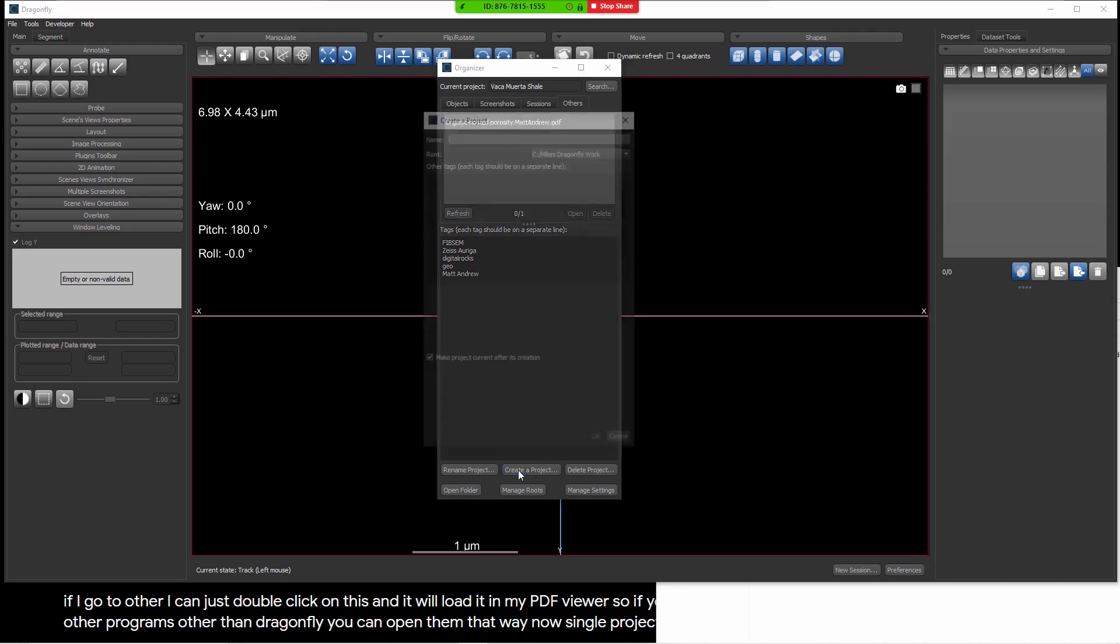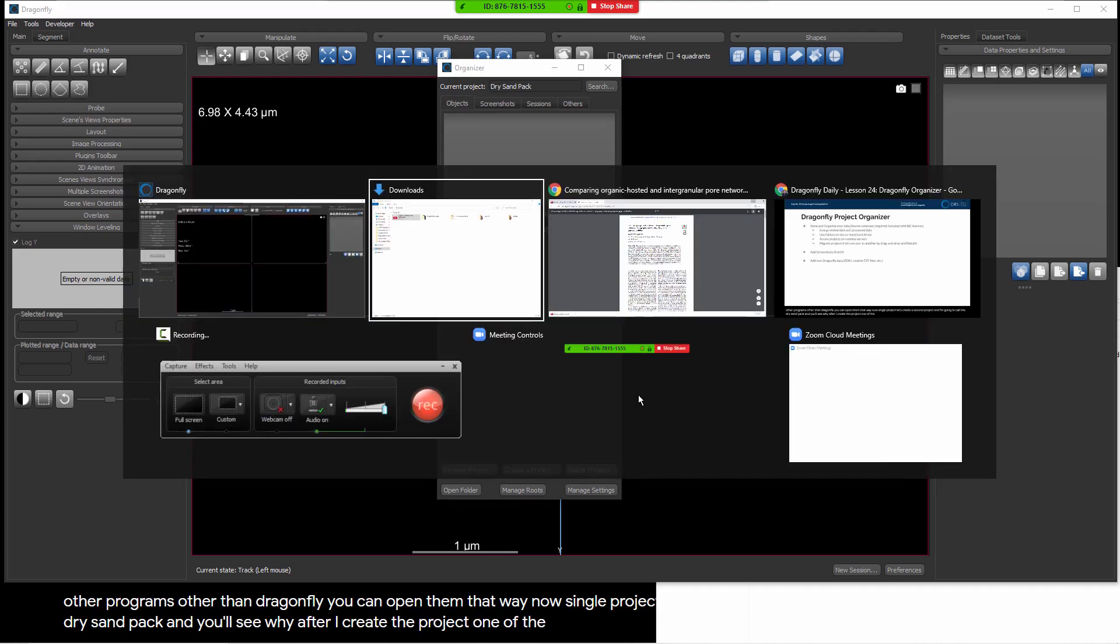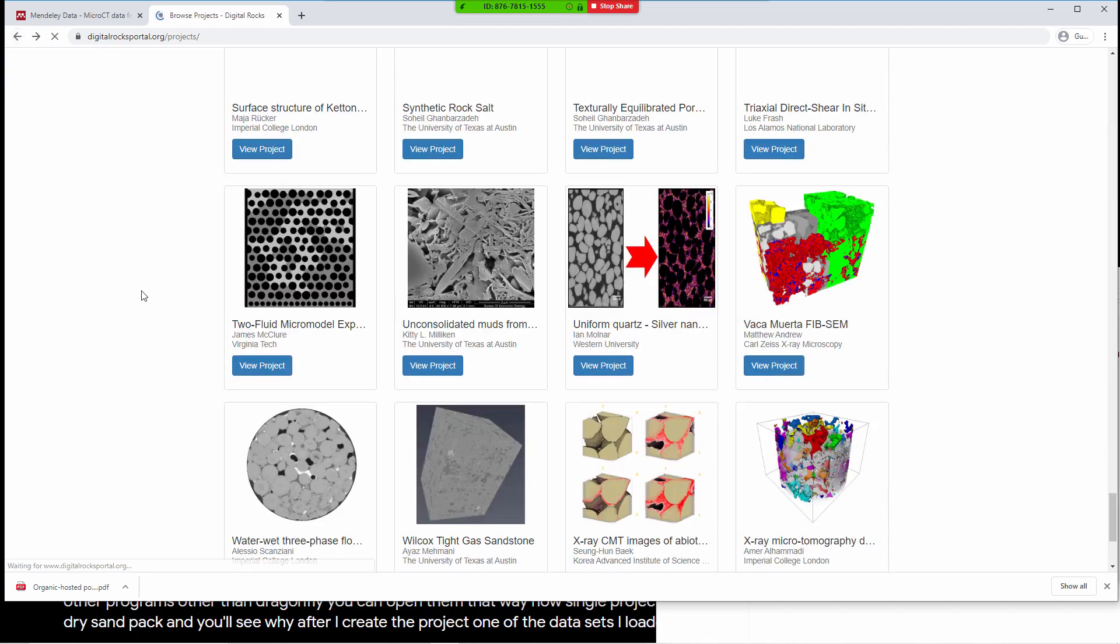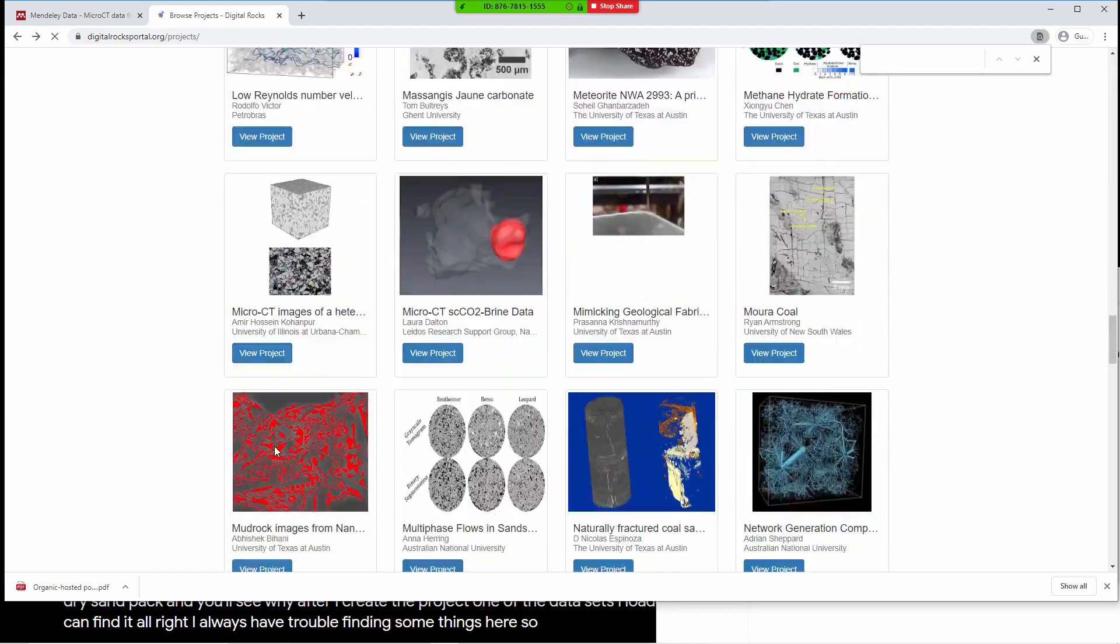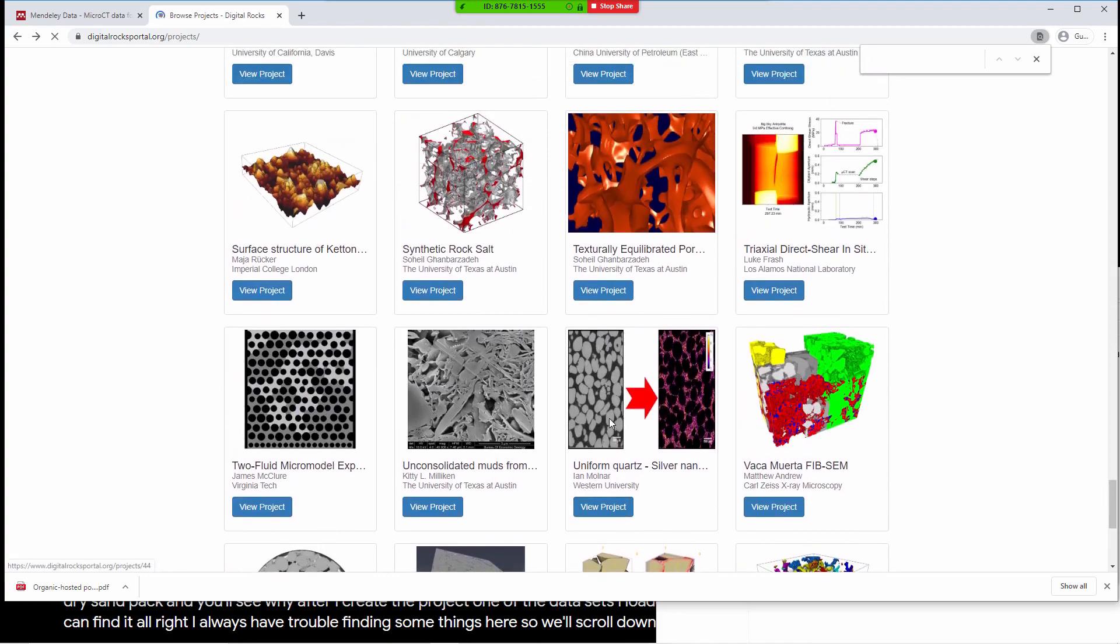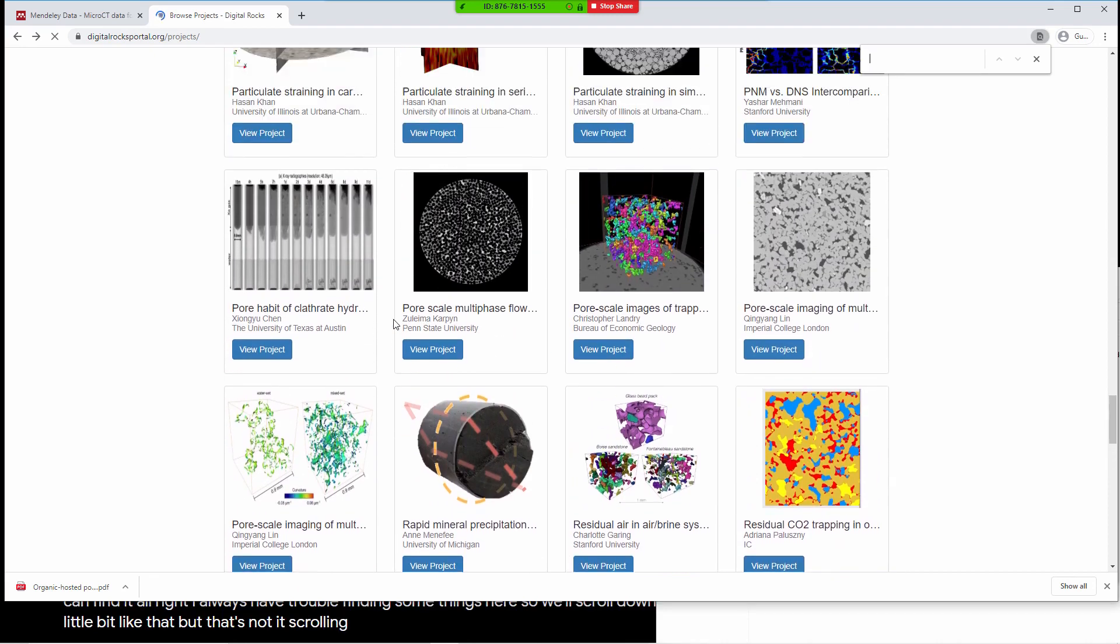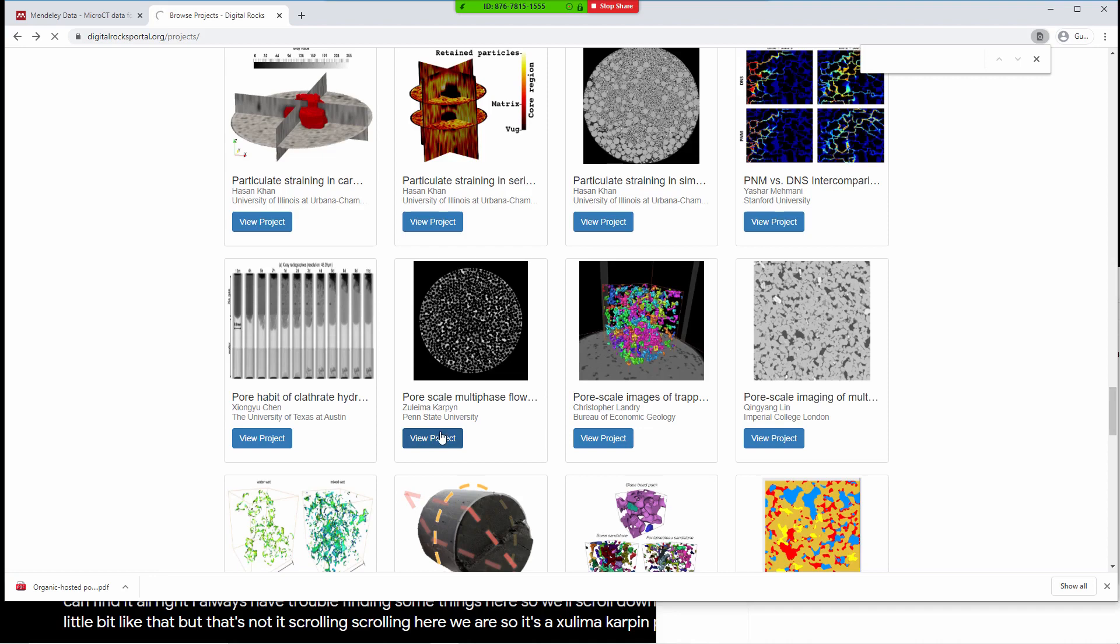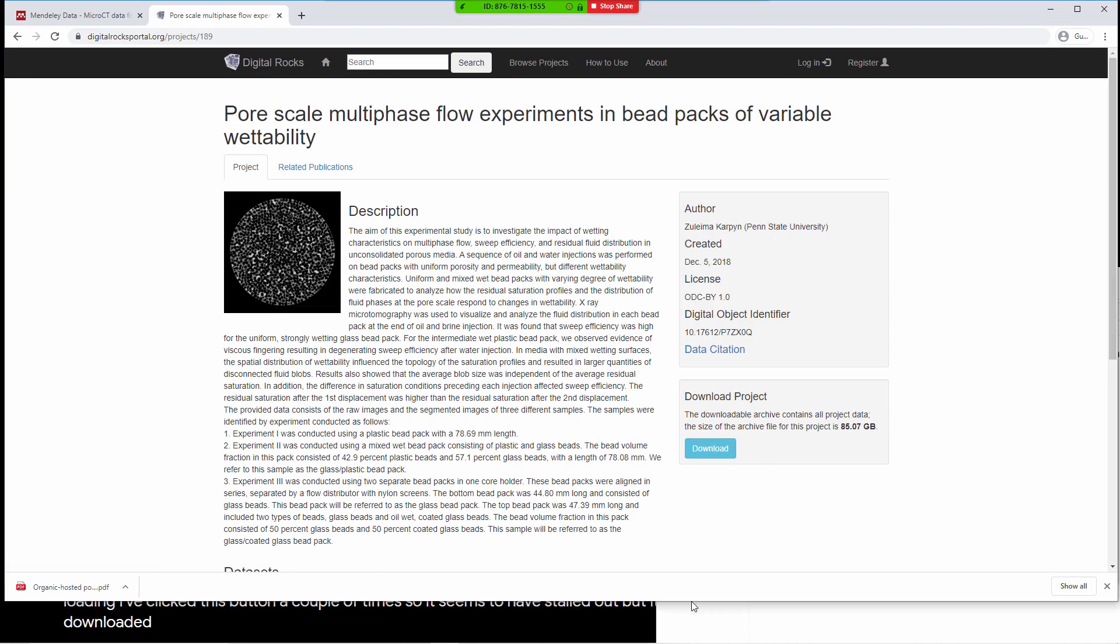I'm going to call this Dry Sandpack. One of the data sets I loaded comes from the Digital Rocks portal. Let's see if we can find it. I always have trouble finding some things here. So we'll scroll down, see if we can find it interactively by browsing. Here we are. So it's a Zulema Carpen project from Penn State. Digital Rocks portal is not loading. I've clicked this button a couple of times. So it seems to have stalled out. But it's in this project and it's a data set that we've downloaded.